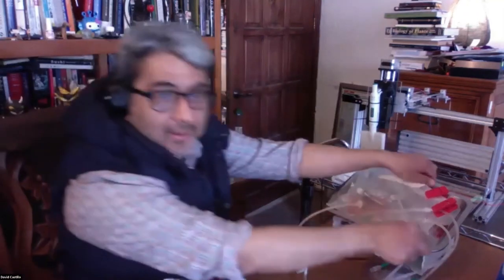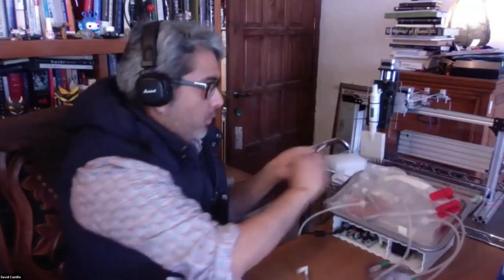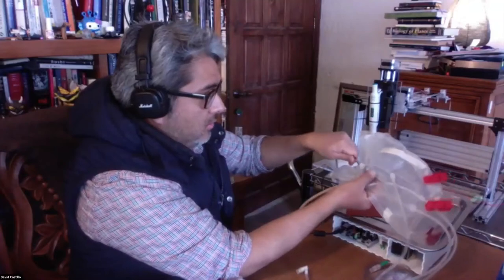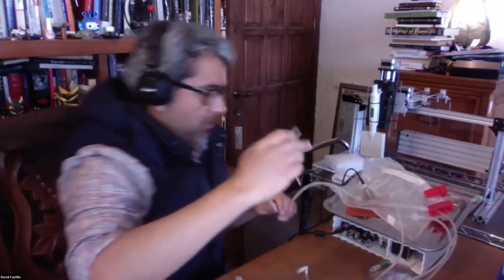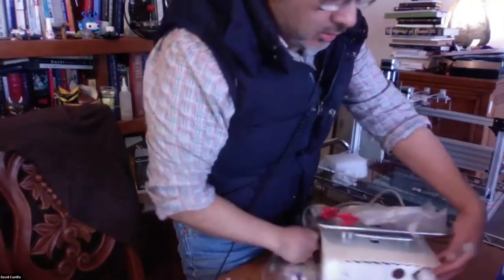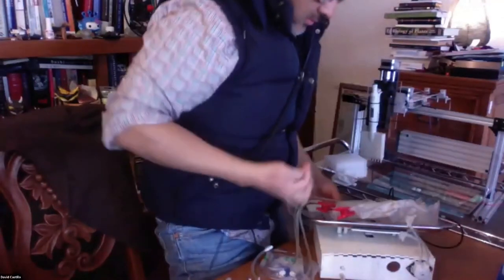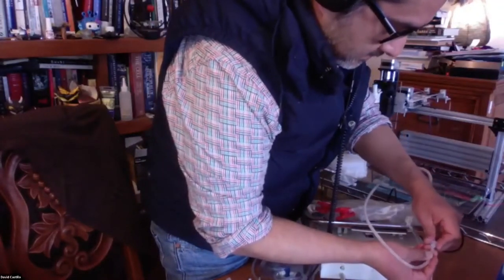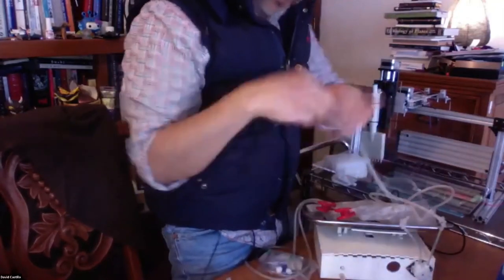Okay, so here's the bag. And I'm going to place first the temperature probe in this port that will have a bar that is already inside it. And here is one of the input pumps. I'm going to place it into this peristaltic pump here. So now it's connected. And this is the air exhaust.